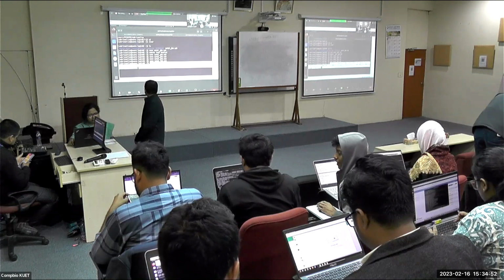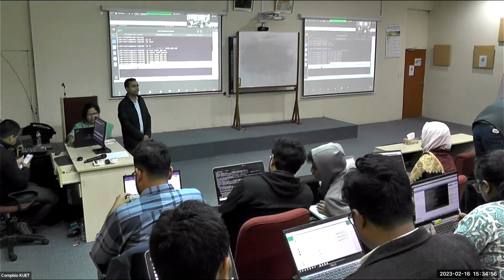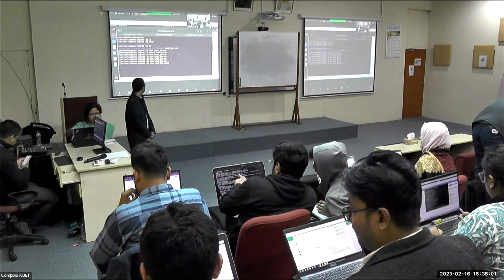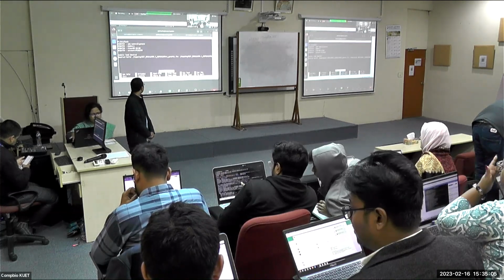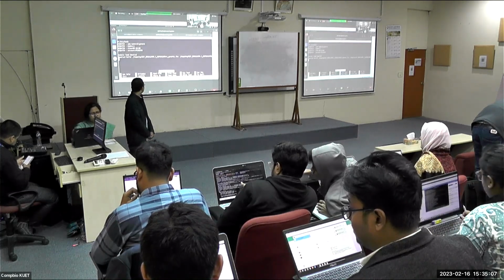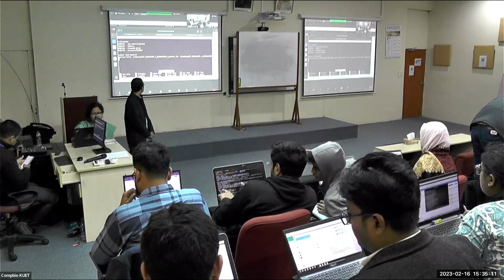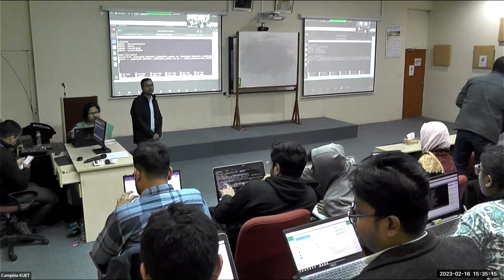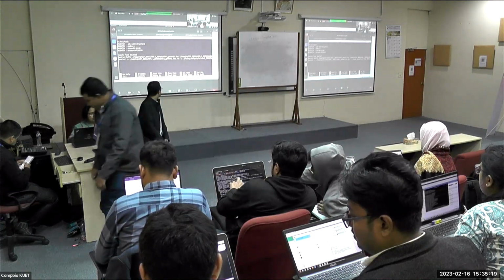So if you are done with the copying, we can now go to the nano sample job submission, this command again, and we can go to the bottom line after this bowtie2-build and press Control-Shift-V. So the whole command is now pasted here.